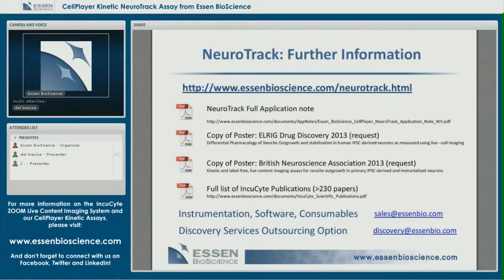We don't typically, in fact, it's probably slightly lower than that. In fact, the slide I showed you was 96 well data, so the range that was on that slide, as I recall, was 8 to 20k per well, maybe 25k per well. So within that range, I will double check and get back to you. So thank you for that question.